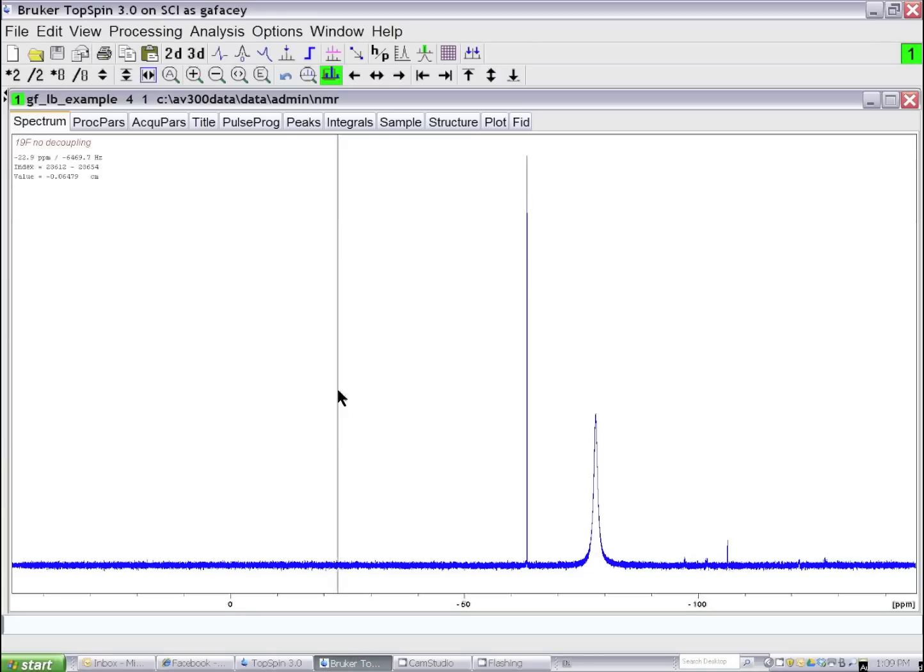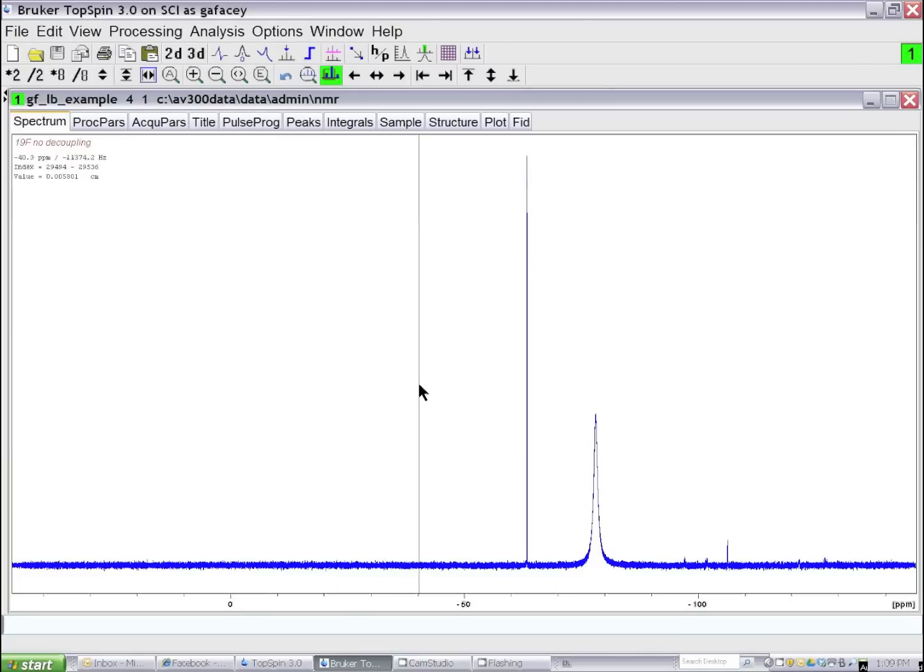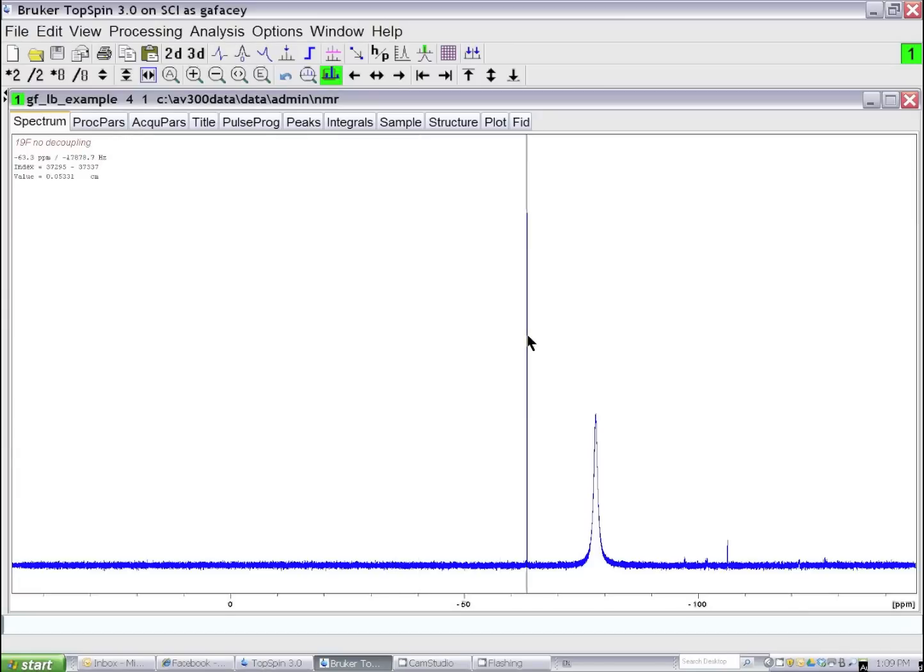I'd like to demonstrate a data processing technique to improve the quality of your NMR data. Here I have a fluorine-19 NMR spectrum of a compound, and I can see that the spectrum has a very sharp line.